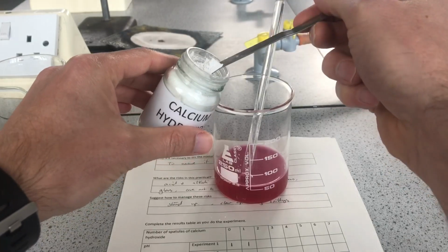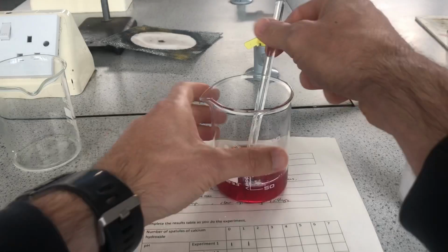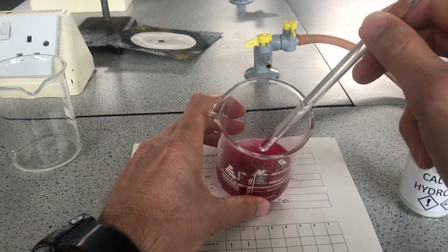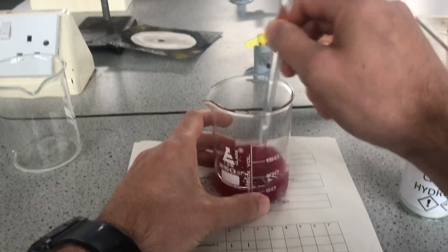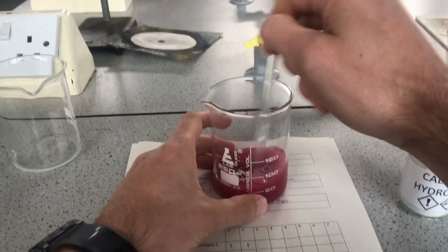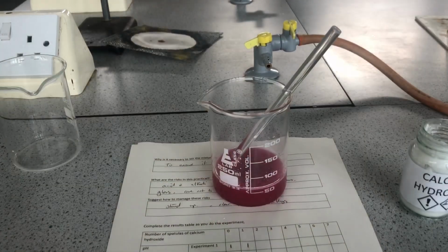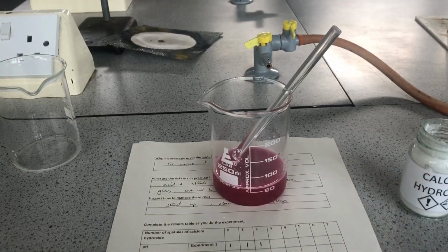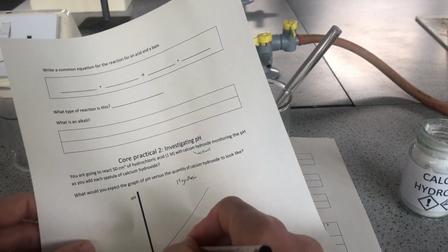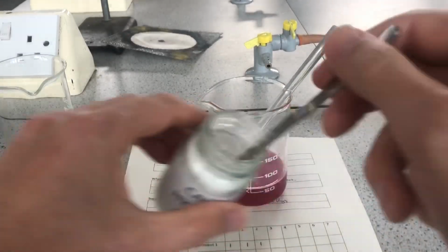Second spatula. Okay. Give it a good stir again. What's nice is, I don't know if you can see, around the calcium hydroxide, the universal indicator looks more blue. But as we stir it up, it reacts in the acid that's in the beaker, and again, no change in the pH. So again, our graph carries on flat, no change. Very different to what people expect.